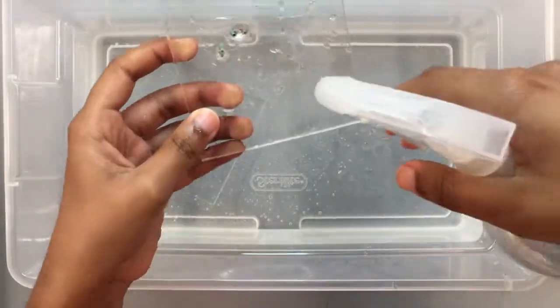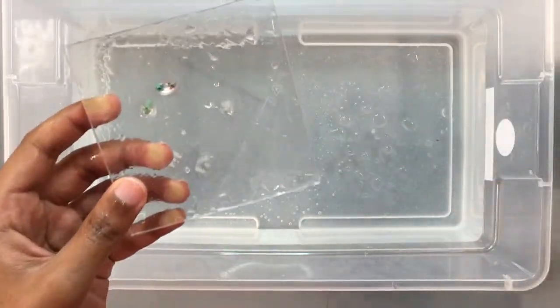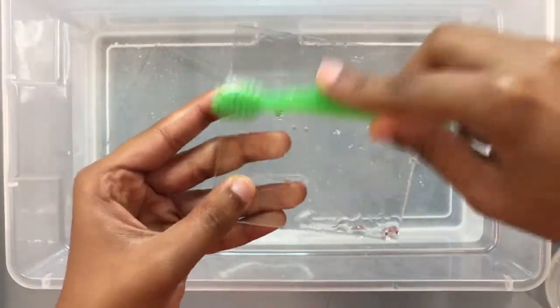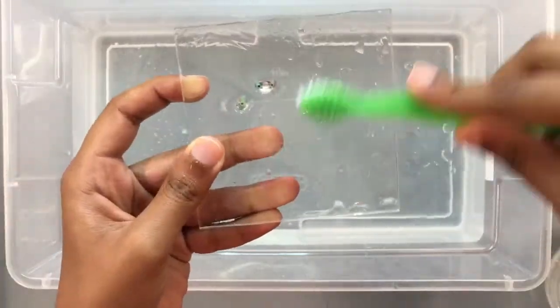Spray rubbing alcohol onto the polycarbonate and gently scrub the surface using a toothbrush. Repeat until all primitives are clean.